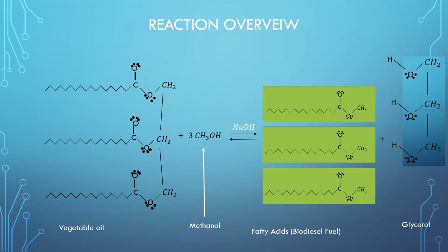This reaction will be helped by a basic catalyst, sodium hydroxide, and use an excess of methanol. This reaction converts vegetable oil into a less viscous solution, which can then be used in an internal combustion chamber. The viscosity of the oil is due to the glycerol side groups of vegetable oil, which can form hydrogen bonds with each other in solution. This makes the solution more viscous and can stall an internal combustion chamber during the fuel injection process.